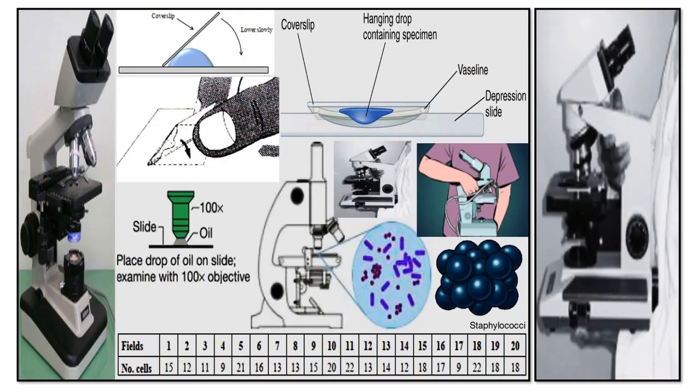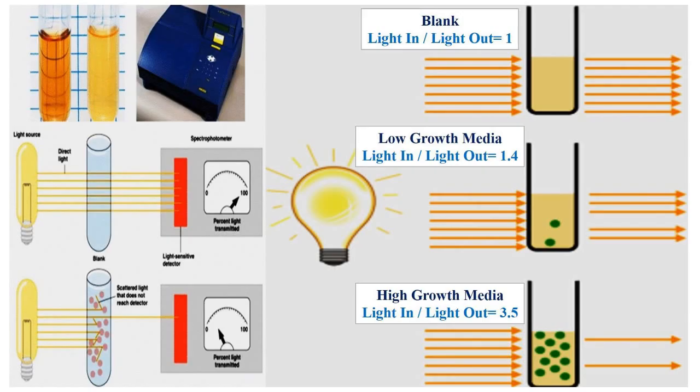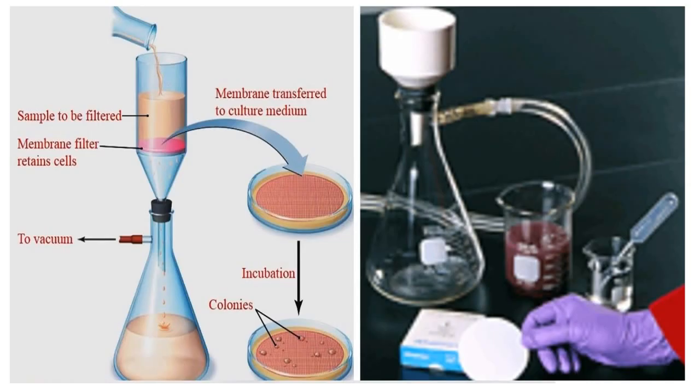Additionally, this slide showed how to calculate bacterial cells by light microscope, while this slide demonstrated how to calculate bacterial cells in broth media by spectrophotometer. Whereas, this slide displays how to calculate bacterial cells by filter membranes.